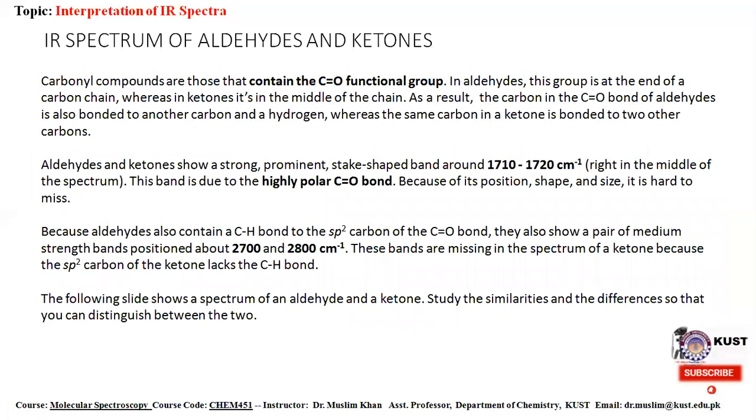Next, the IR spectrum of aldehydes and ketones.